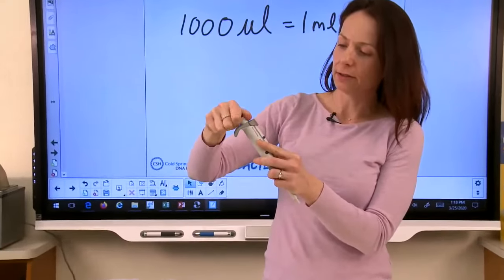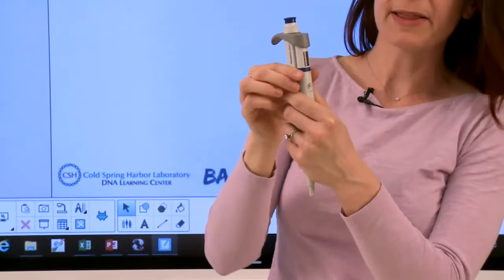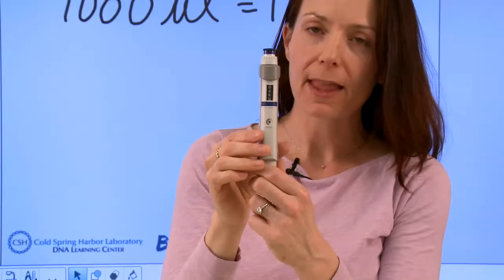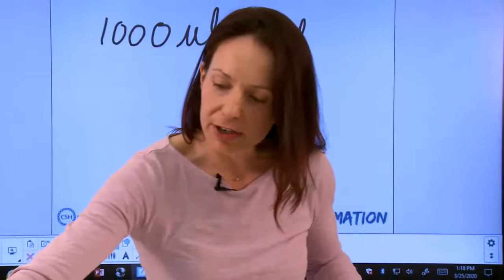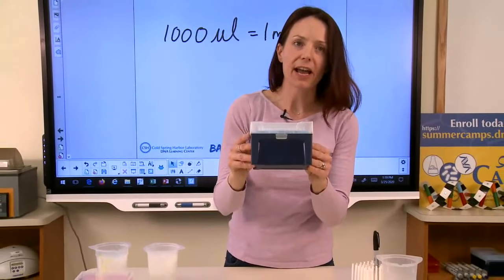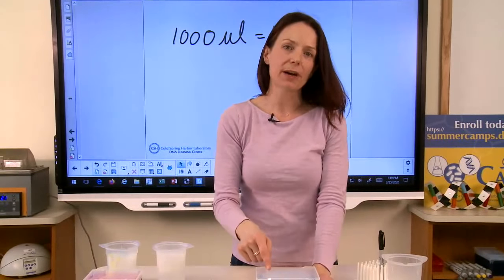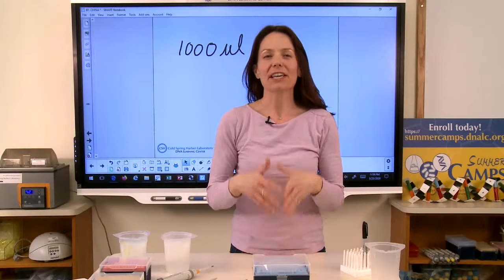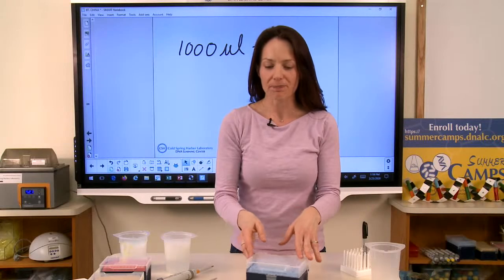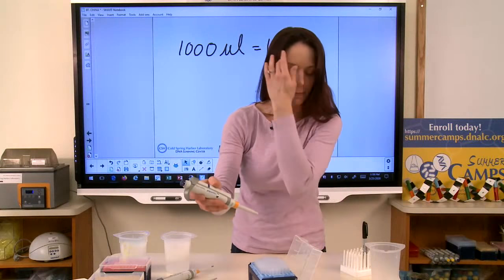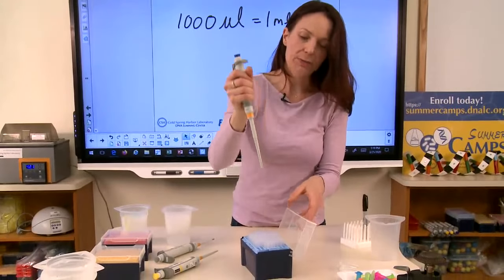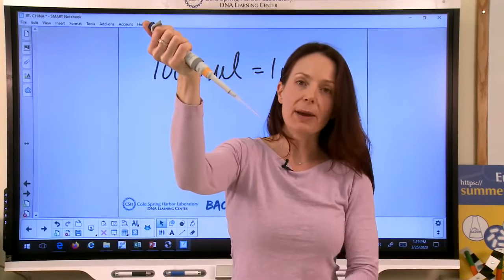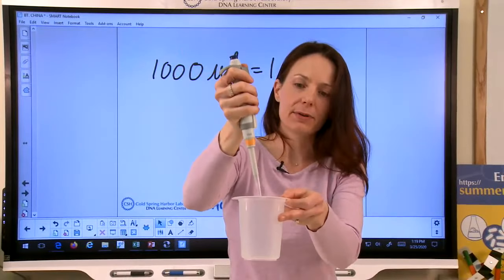What I'd like to do right now on my pipette is I'd like to start off by setting my pipette on 250 microliters. I'm going to just adjust the dial. It says 0250, which is 250. I'm also going to show you that there are tips that go along with these pipettes. Right here, I have a box of tips or bottoms that I can change throughout the experiment and keep everything sterile — keeping everything clean, free of contamination. I'll just show you for practice what it looks like when I place one of these tips on. You see how it just attached itself? I can then use the pipette to transfer liquid between tubes. When I'm done, I'm just going to change that tip and get a new one.